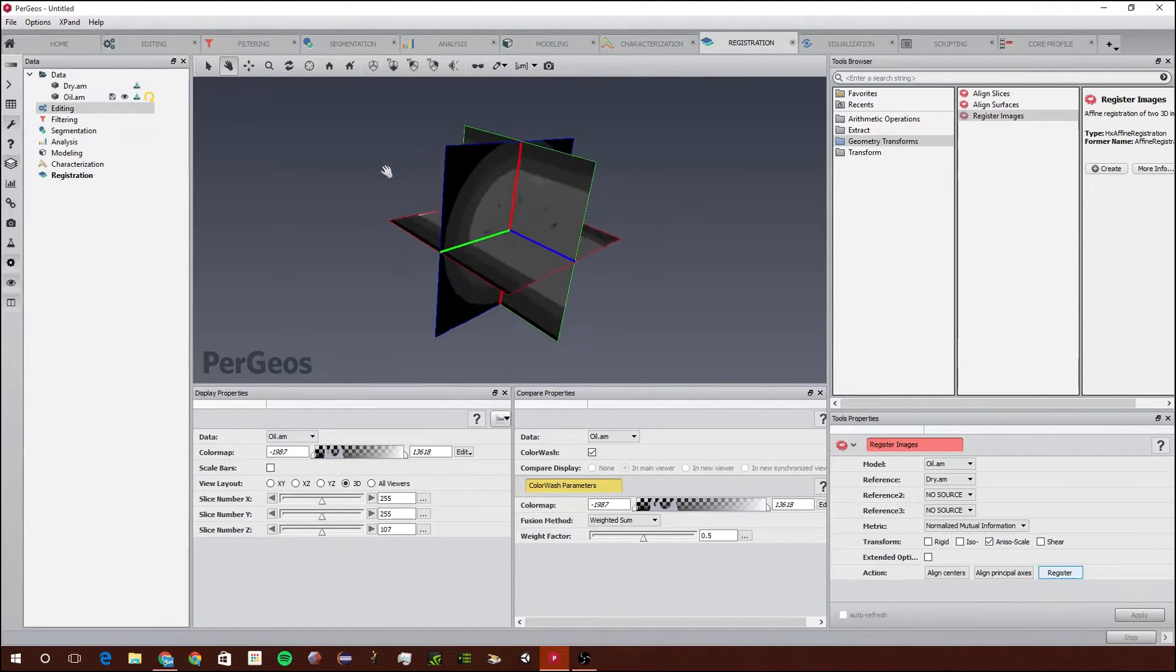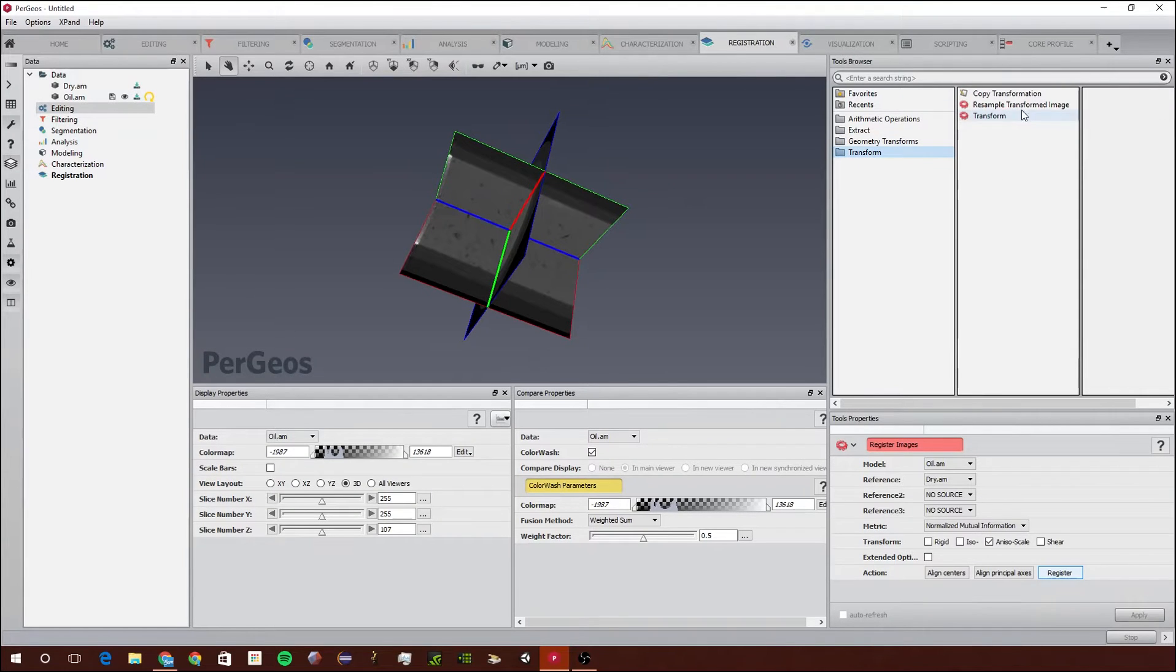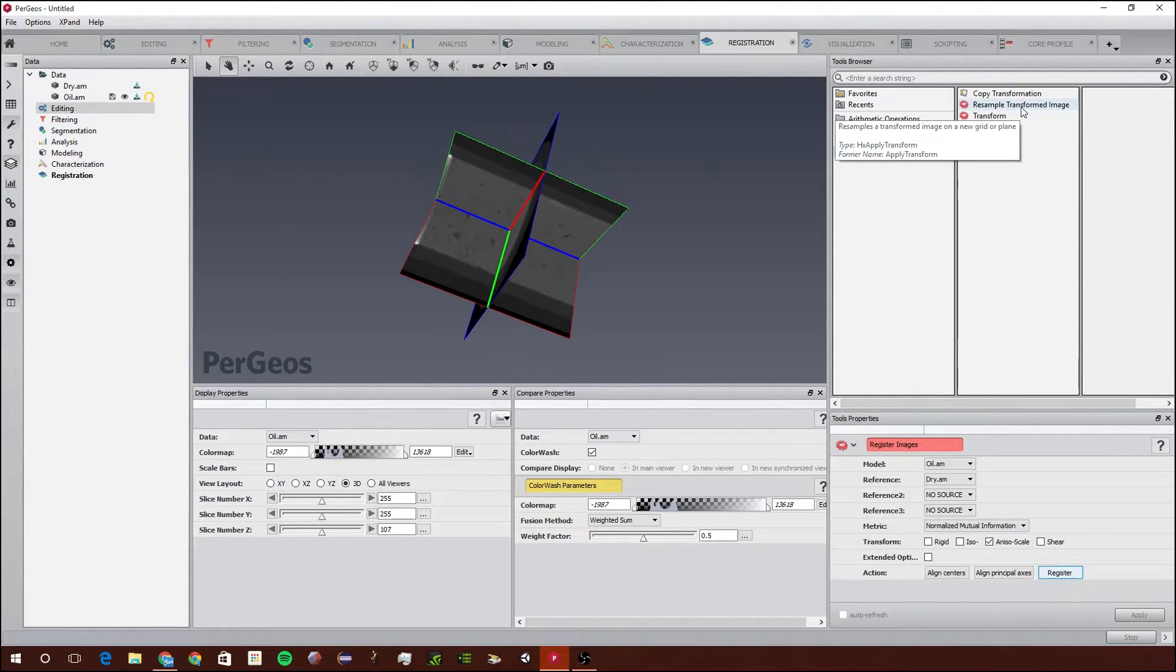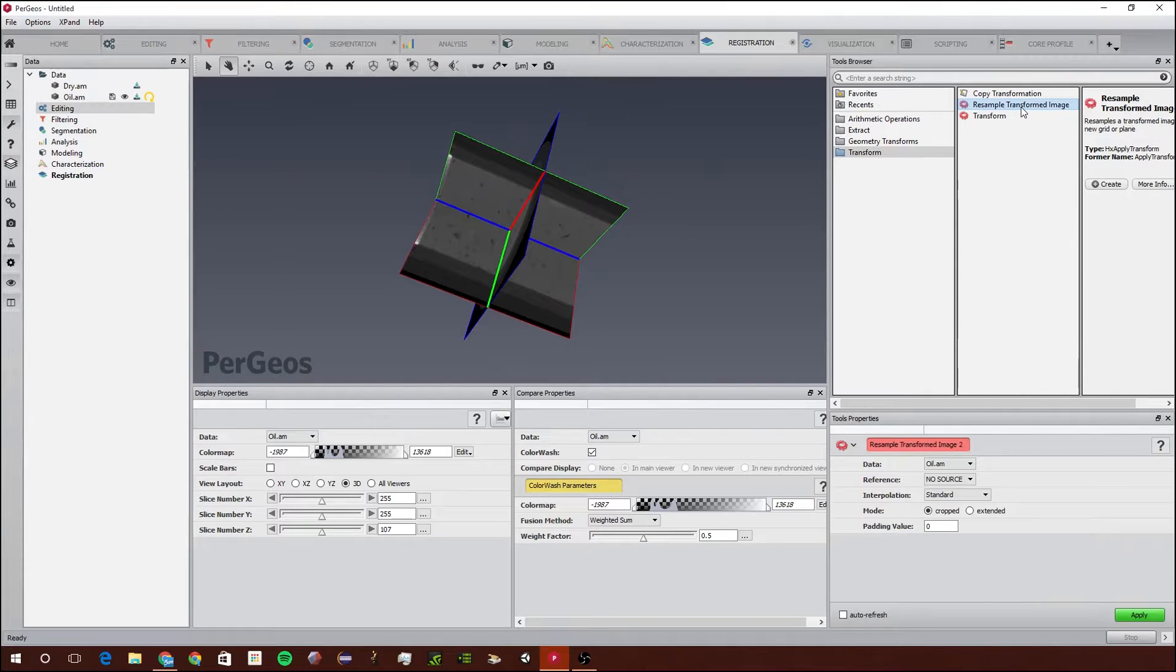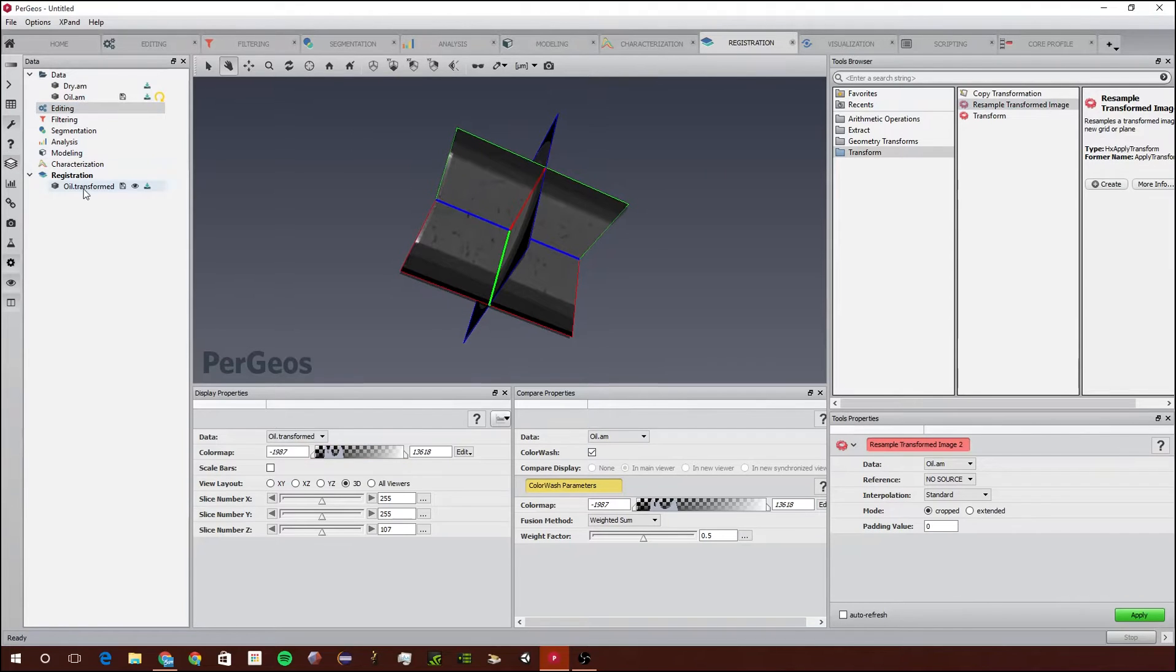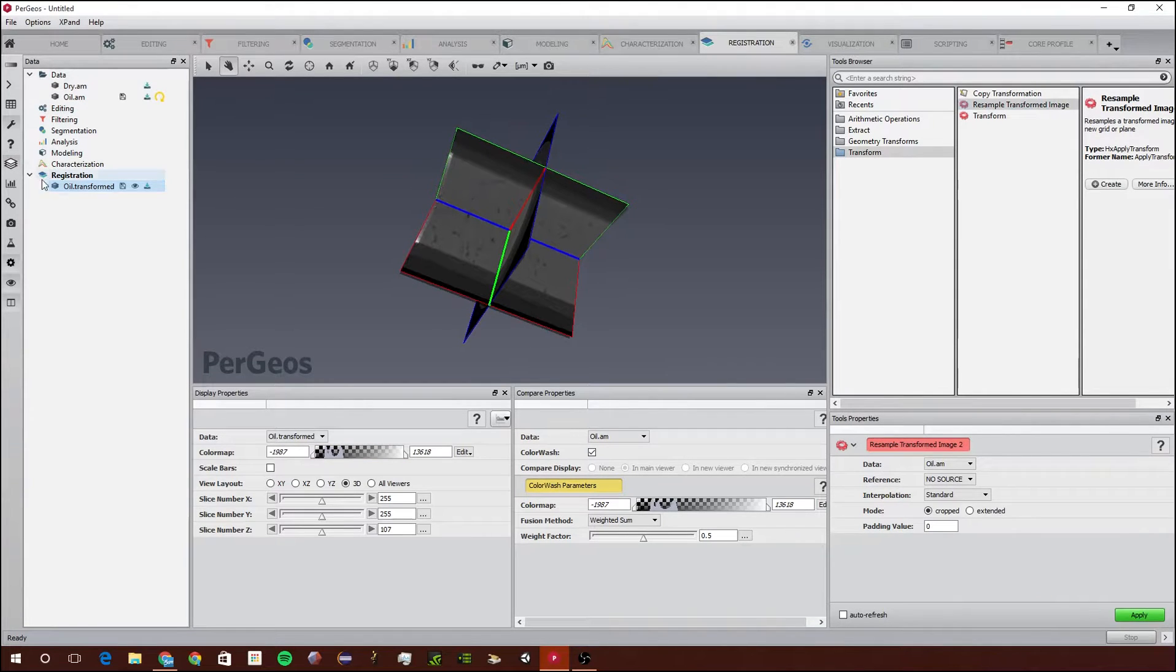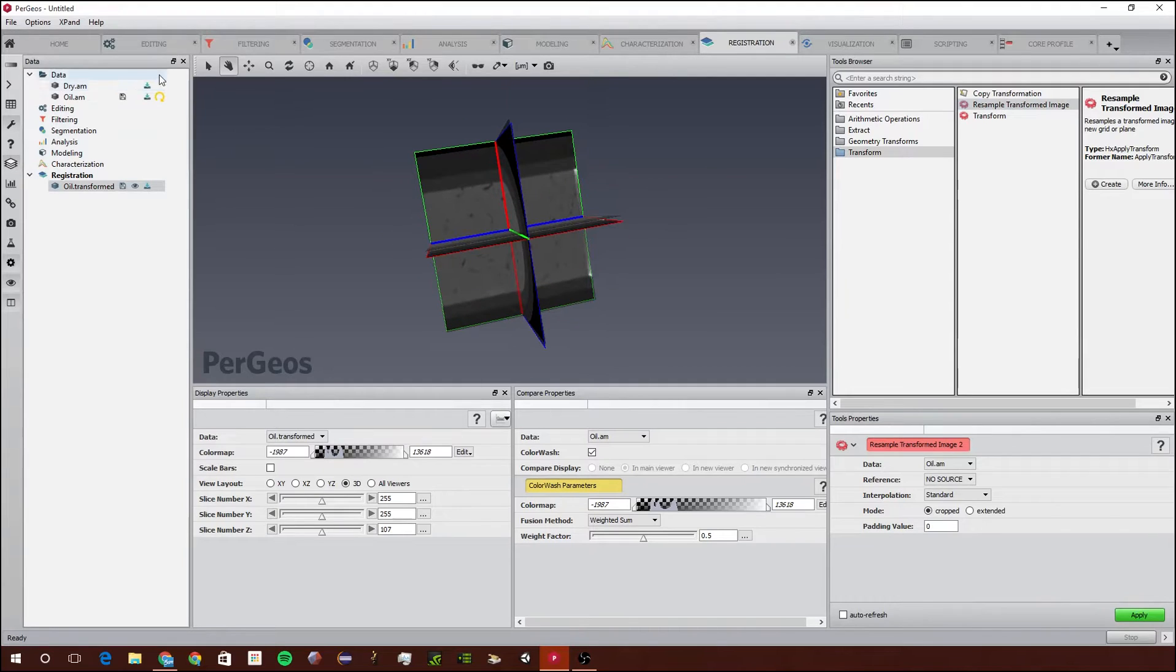Now that we have the images aligned, we need to apply the transformation. To do that we're going to go to Resample Transformed Images and double click on that, and we're going to click Apply. As you can see, oil draw transformed is right here and now they're both perfectly aligned.